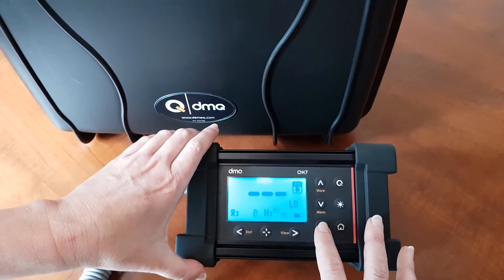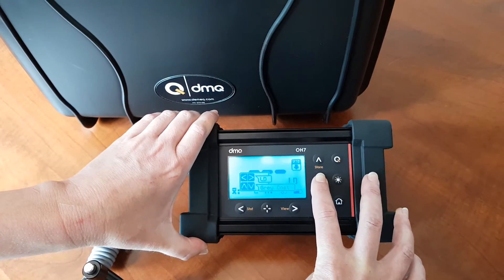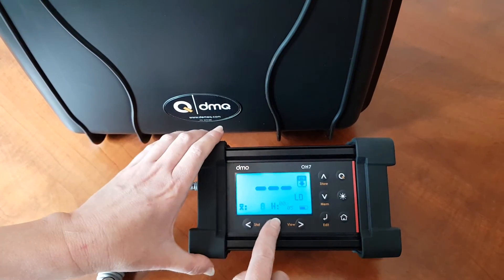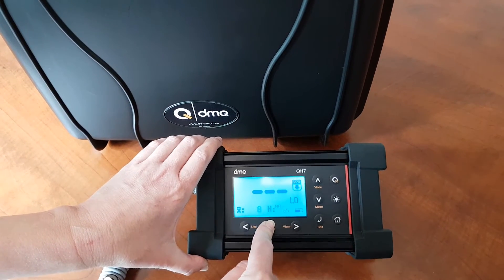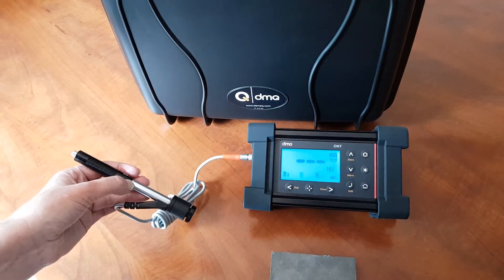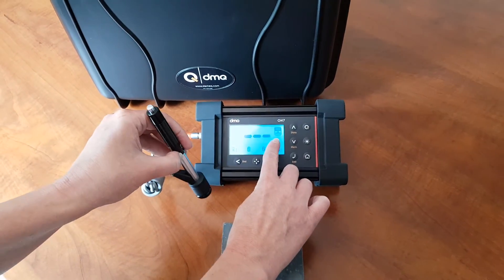The QH7 has built-in material types and different units of measure, along with Caltech technology for automatic probe detection and Gyro technology for automatic impact direction.